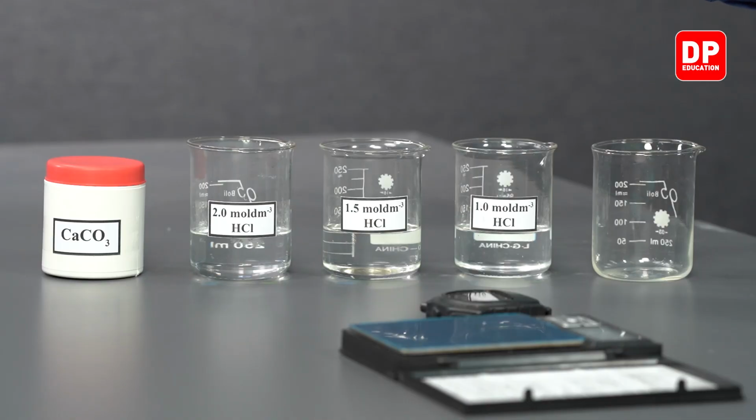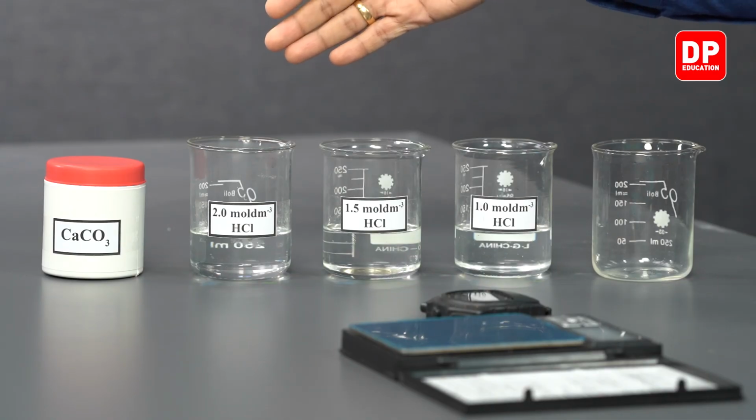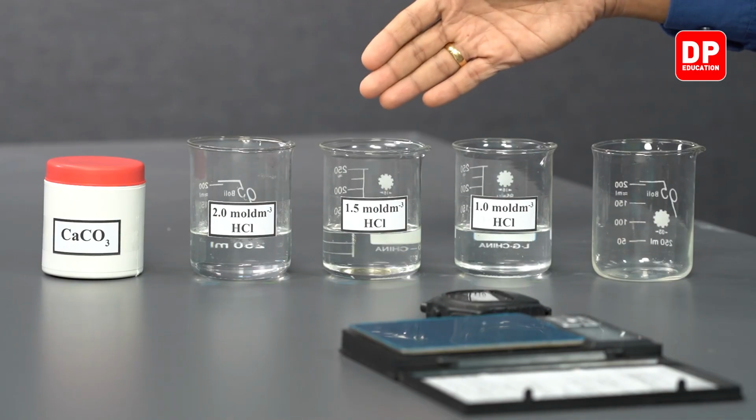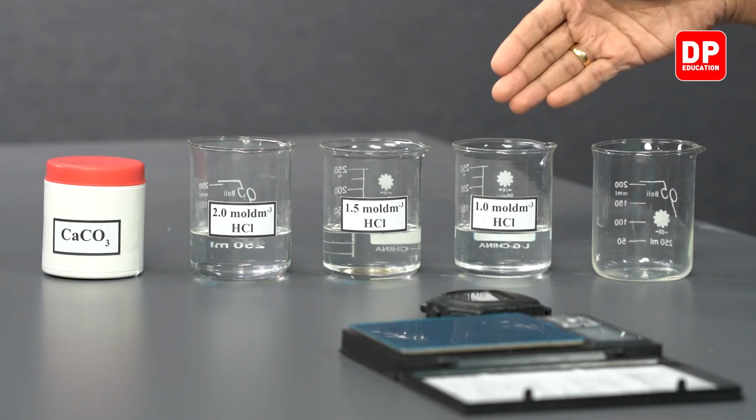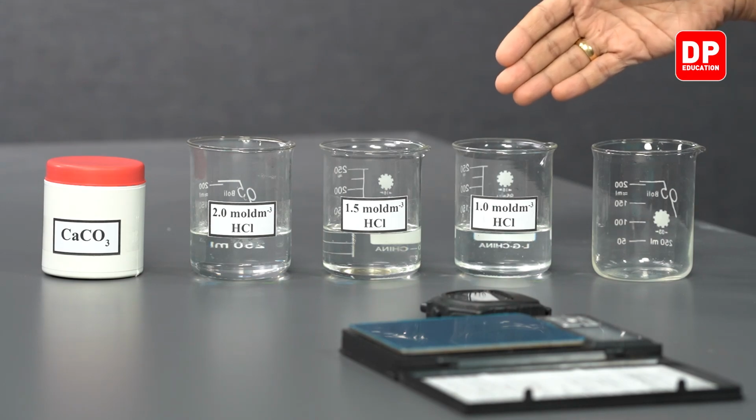In this reaction, we can see calcium carbonate with HCl, like I mentioned earlier, will produce carbon dioxide. To carry out this experiment, this is the equipment we'll be using. We'll be using calcium carbonate, 2 moles per decimeter cube HCl, 1.5 moles per decimeter cube HCl, and 1 mole per decimeter cube HCl.